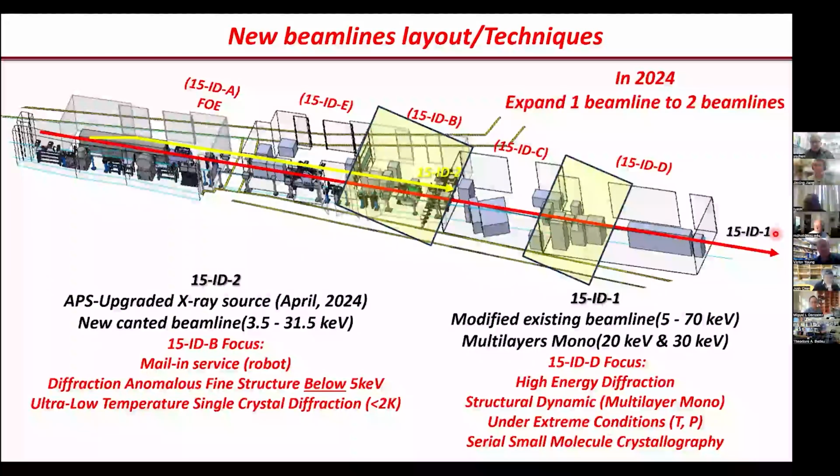Hey, Yusheng. Hey, Ian. Do we have any idea on how the new beam intensity and shape will affect in situ measurements in terms of increased background from capillary shields and things like that? You mean the background, right? Yeah, like we're using the capillary shields for the gas flow experiments. Do we expect a higher background, and do we have a plan on how to address that?